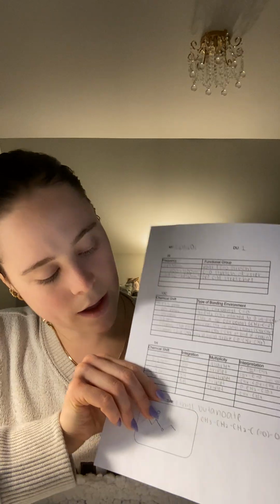And this is a classic layout of ethyl butanoate, which the structure, which I have right now here, would be CH3, CH2, CH2, carbon, double bonded to an oxygen, and then single bonded to another oxygen, and then from there a CH2, CH3, as I have here.